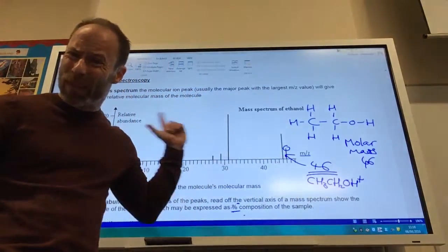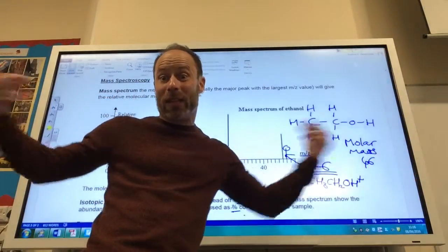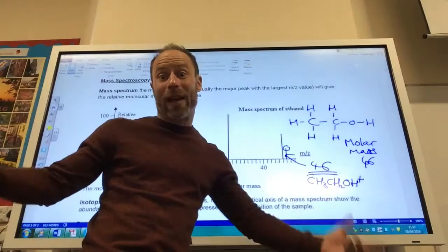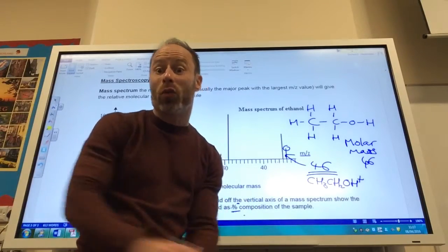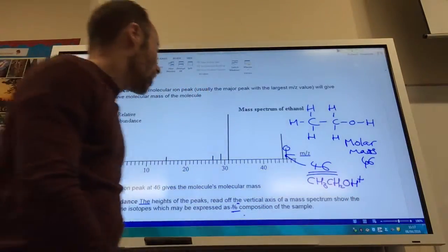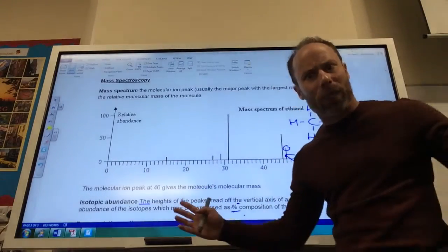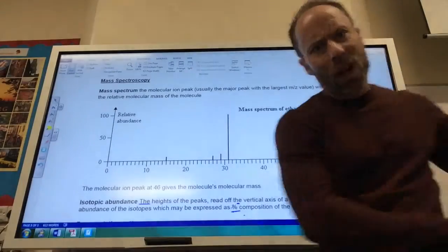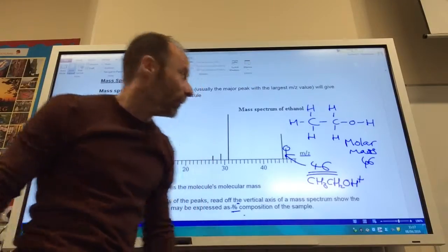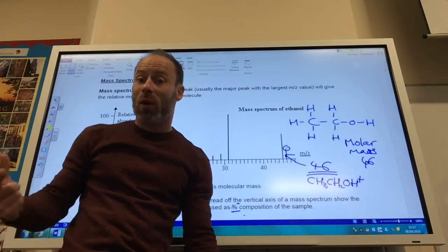But you can see I've got other peaks going on here. So what's going on? Let's have a think about it. You've got ethanol with a plus charge on it, in a vacuum, in a very excited state. What's going to happen? It's going to go crazy, bonds start breaking, and you get fragmentation patterns. So not all the molecules survive. Some of them break up in the mass spectrometer. They fly through the machine, and as they do, bits fly off here and there all over the place. And we can use this to build up what the molecule would look like.